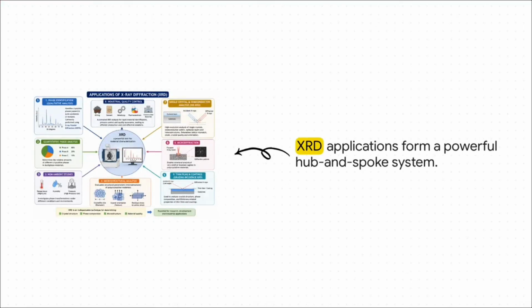If modern material science had a superhero, well, the XRD machine would absolutely be it. It literally forces a substance to spill its most closely guarded structural secrets. Think of this whole setup like a giant blueprint. The automated XRD machine sits right at the center of this massive hub, and every single arrow pointing outward is a totally distinct, incredibly important application powered by this one core technology.